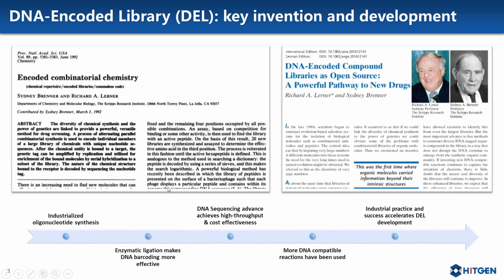Second, in the 1990s and in the early 2000s, the next generation sequencing technology that is used for identifying ligands with high affinity for a biological target was immature, and the NGS cost was very high. Although the groundwork of DEL was laid in the 1990s, the field lay dormant until the mid-2000s.